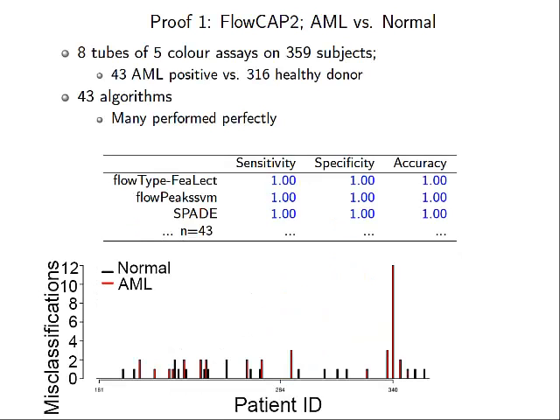So, trying to get around that whole problem of what the gold standard is, the idea that we had is that we need something other than manual gating to tell when gating is working well. The way we approached that problem was to find some measure outside of drawing boxes around dots. One way we thought about doing that is if you have some diagnosis on some samples, you get an expert clinician to look at some samples and say, this patient has AML. Hopefully there's something extra in there, above and beyond this particular cell population has 27 dots and this one has 24 dots. It's a sort of meta-analysis. It gets around this one versus two dots inside this population.